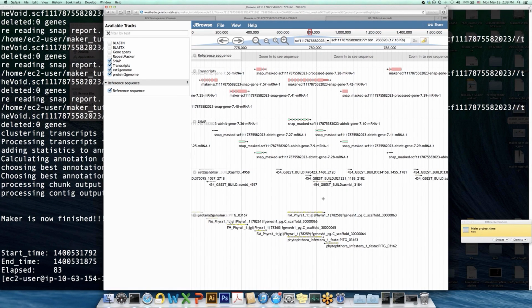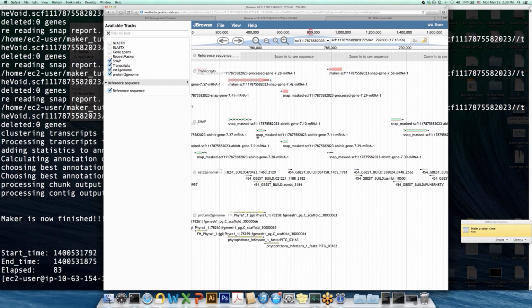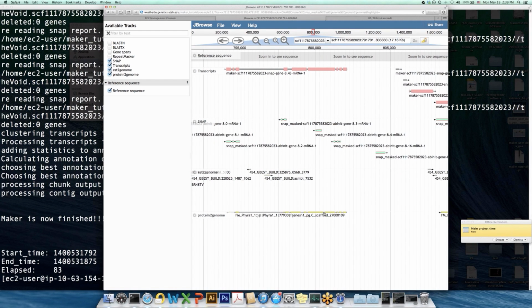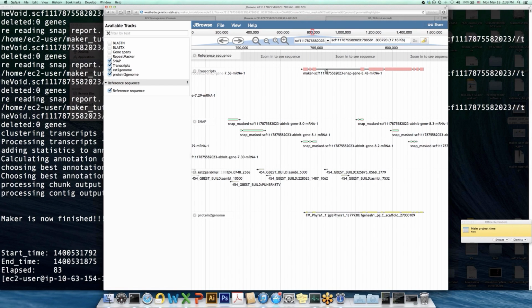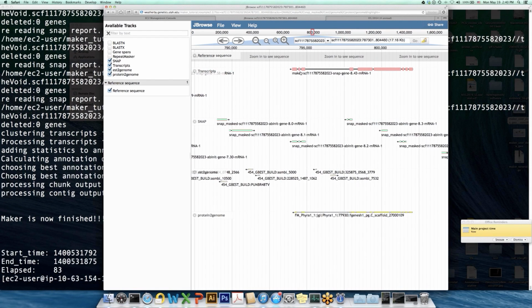So as you can see, even though we have a roughly trained gene predictor right now, Maker performs better than SNAP alone because it has that feedback with the evidence, where it's able to tell SNAP about details that it just can't see otherwise. For example, here, this gene, we have a nice long protein suggesting there's a longer gene on this strand. SNAP's calling many small genes. After talking with SNAP and showing it the evidence, SNAP says, well, maybe it is a bigger gene, and SNAP calls it differently. Okay, so because these Maker genes seem to be slightly better than the current SNAP genes, we can now retrain using this first set of Maker genes. And supposedly, this should even be better models than our EST genome models, and SNAP can use these genes to do even better. So this is called bootstrap training.